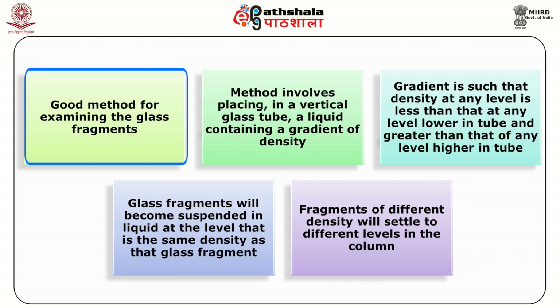Density gradient method. Density gradient method is a good method for examining the glass fragments when there are a number of glass fragments, that is, several unknown samples or several possible sources.